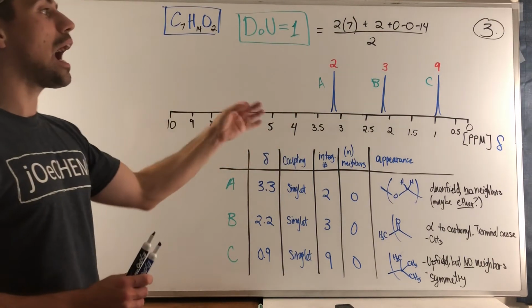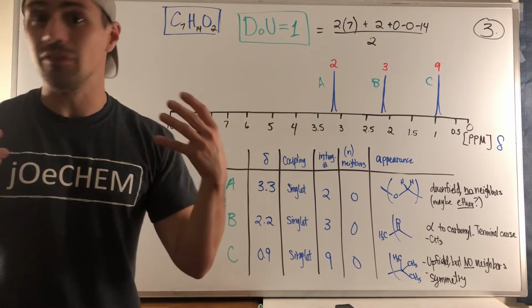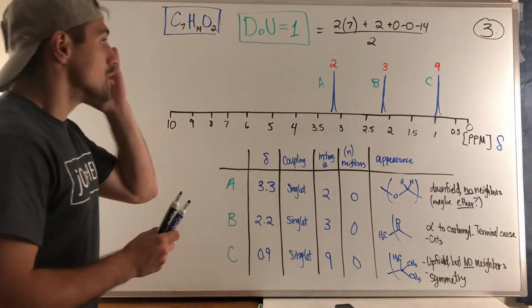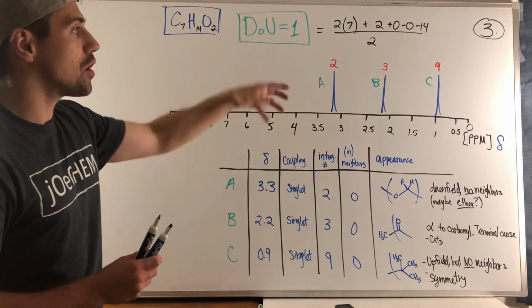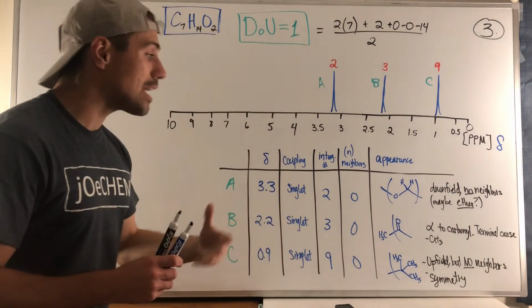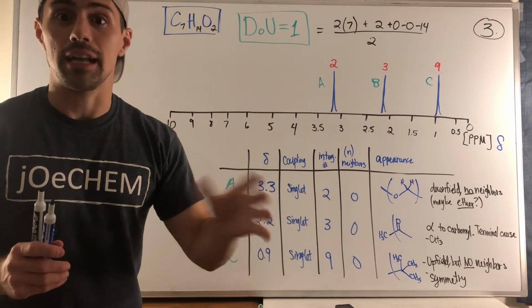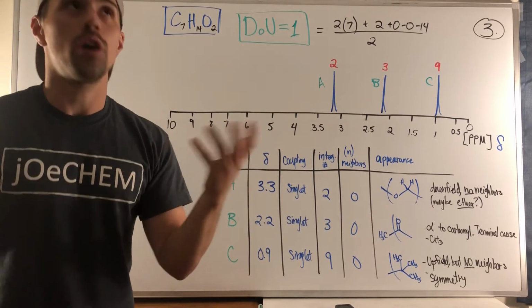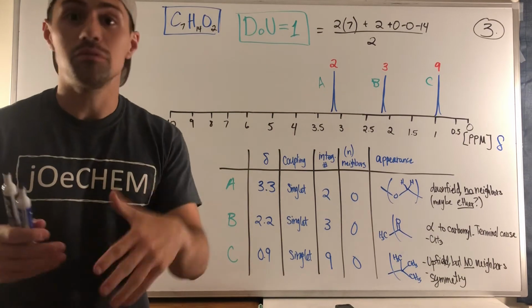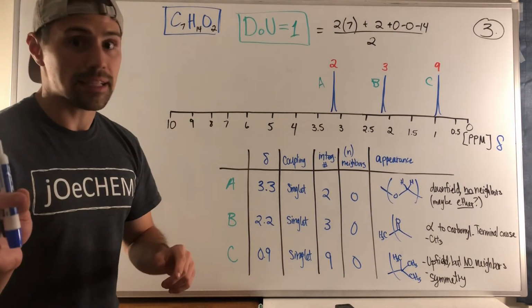We see we have many hydrogens that correspond to letter C, that signal. That means there's a lot of symmetry there, okay? So I want to actually start there first. So if you can see, the appearance I'm suggesting is that we actually have kind of like a T-butyl group at the end of our chain. And now, it's weird, and you might think, Joe, how did you know that? Well, you get it after you do some problems, but think about this, because it makes sense.